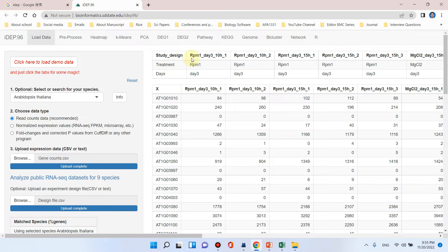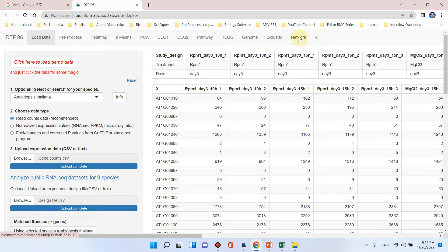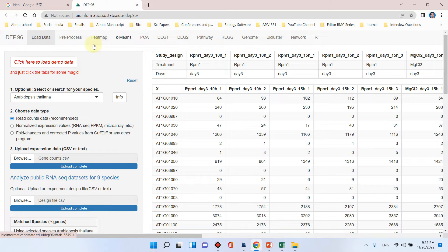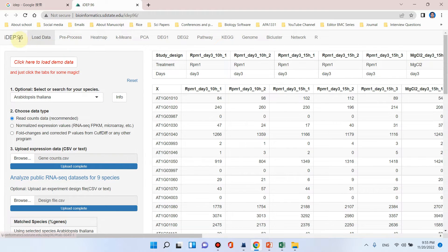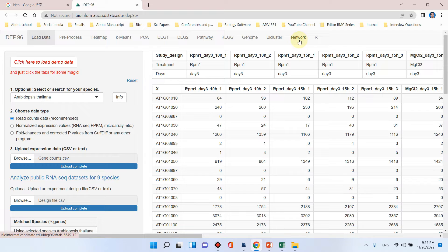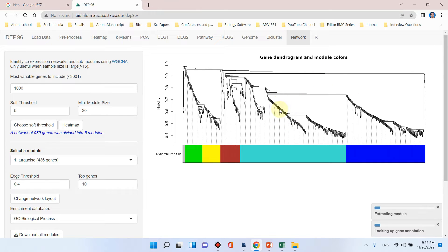For WGCNA analysis you can skip all of these steps and can directly go to this network tab because all of these steps belong to RNA-seq analysis. I have already prepared a separate video if you are interested in learning RNA-seq analysis using iDEP tool, so you can go through the details of all of this. But if you only require to do WGCNA analysis you can simply click on this network tab.